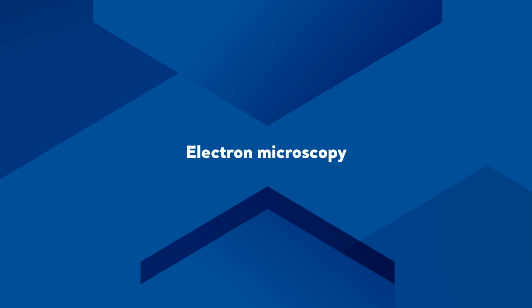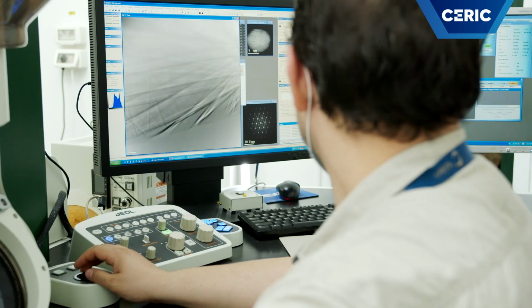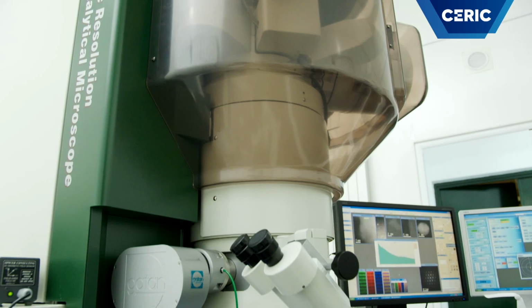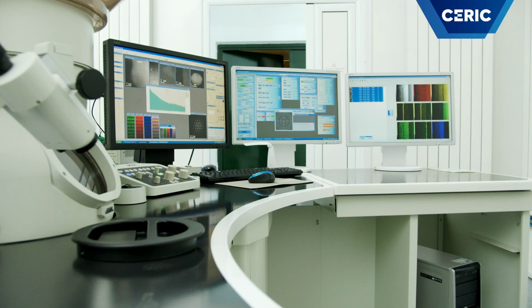In the measurement, we obtain averaged information from the sample, averaged to the whole in-beam volume, which is an advantage compared to other surface-sensitive techniques such as electron microscopy. In most of the cases, SANS can complement X-ray scattering methods, but also other nanostructure characterizing methods, like electron microscopy and others. Most of the samples do not get activated. They can be taken by hand immediately after the experiment.